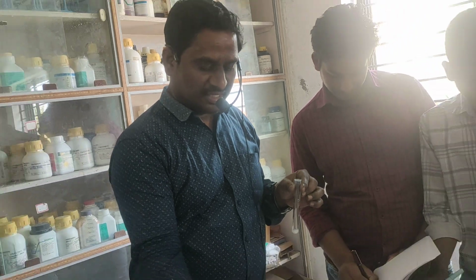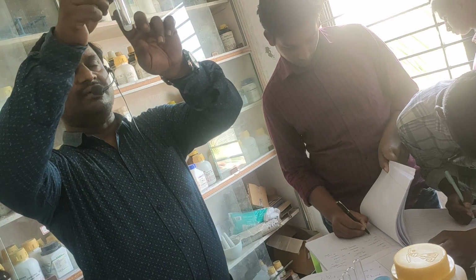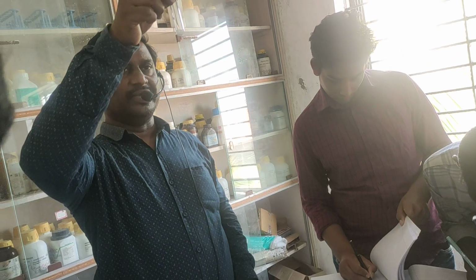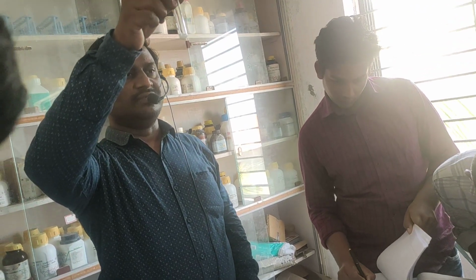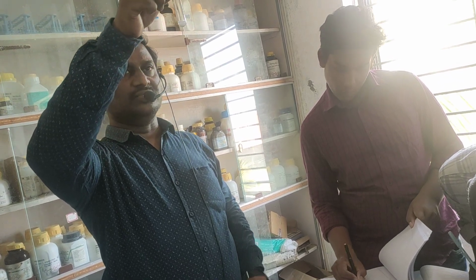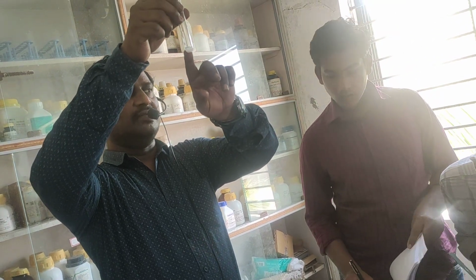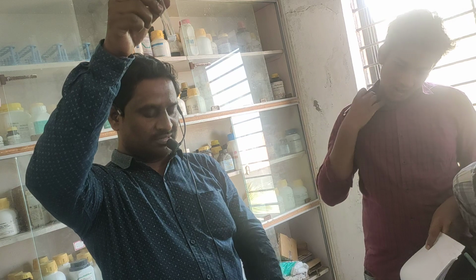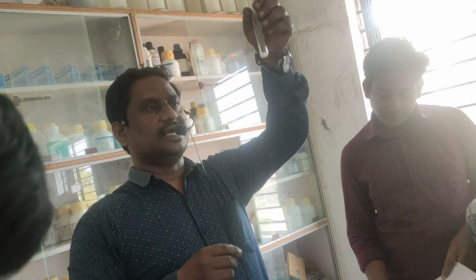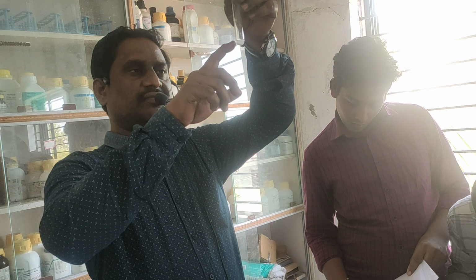Next, detection of acid radical. Keep heading: detection of acid radical. First point: test for CO3 minus 2. Salt plus dilute HCl. Colorless gas is evolved with effervescence.